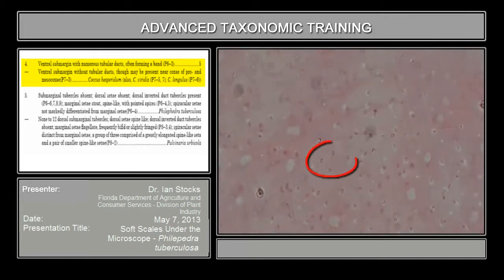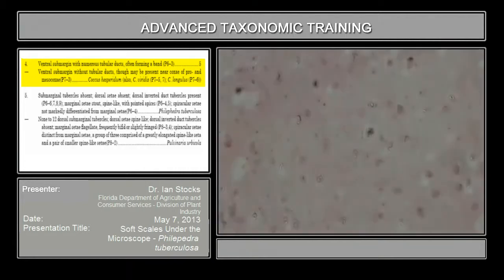These pale spots in these fields of, in this case, pink. And each one of those is associated with another structure. So this is, at fairly low magnification, another type of tubular duct. Find a good patch of those, and then go up, if you can, to the 40x.